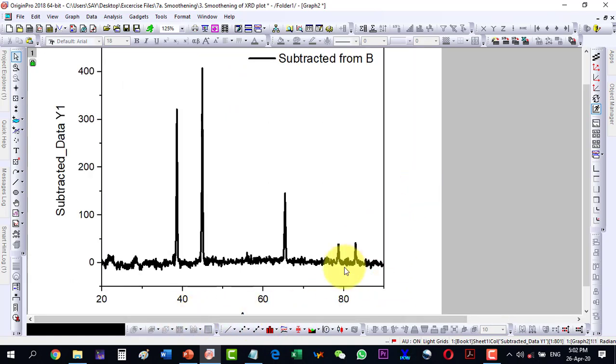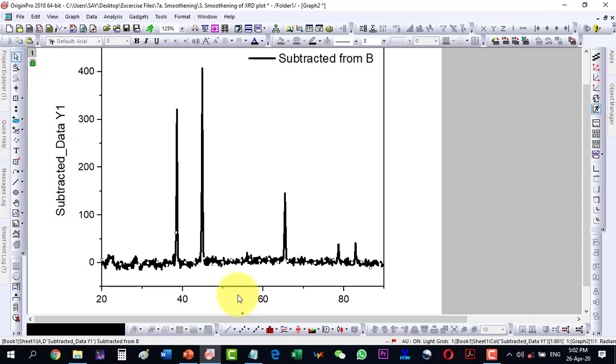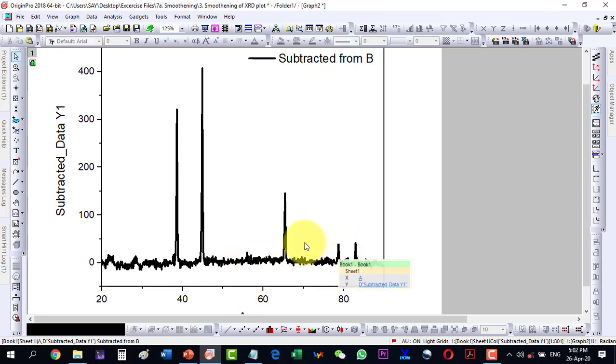So now the plot is fine, but I will have to smooth this plot in order to remove the noise which is here. These peaks are of interest while this noise is supposed to be removed. So select this one.